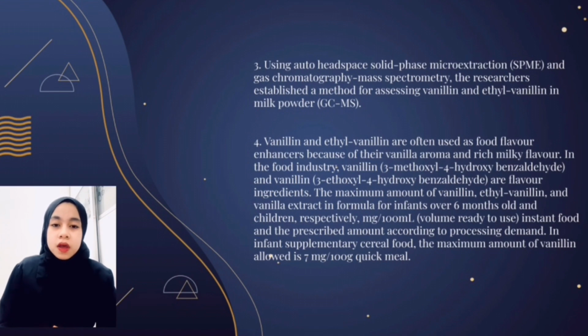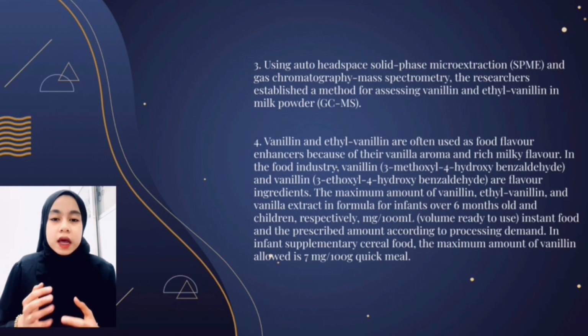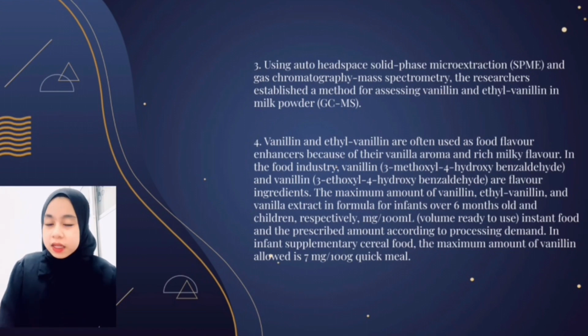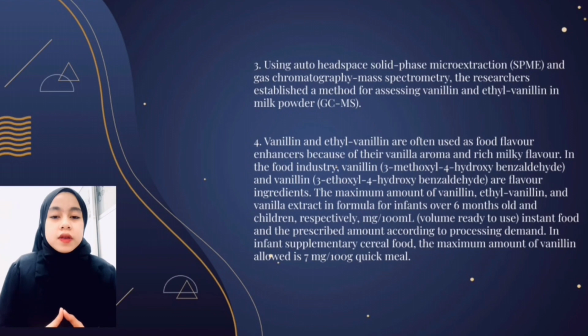Due to its vanilla scent and strong milky flavor, vanillin and ethyl vanillin are commonly applied as food flavor enhancers. Vanillin (3-methoxy-4-hydroxybenzaldehyde) and ethyl vanillin (3-ethoxy-4-hydroxybenzaldehyde) are flavoring additives used in the food industry.